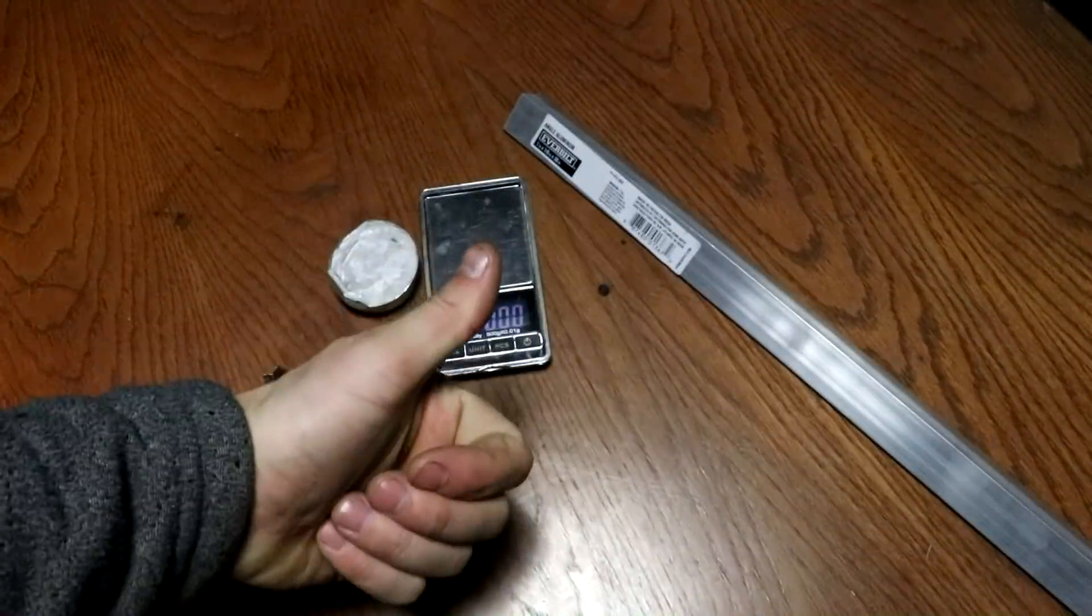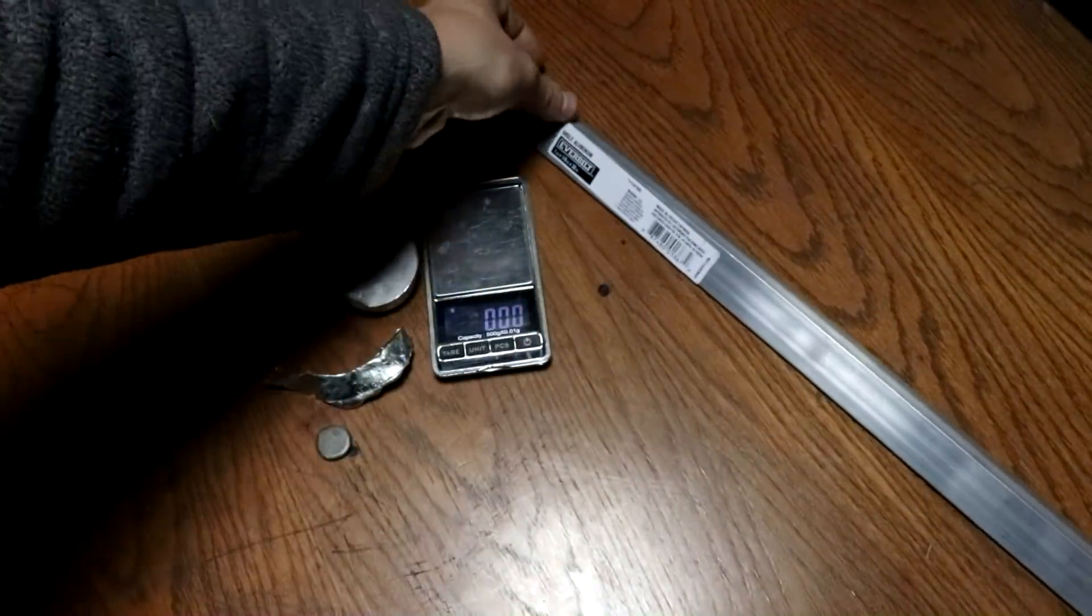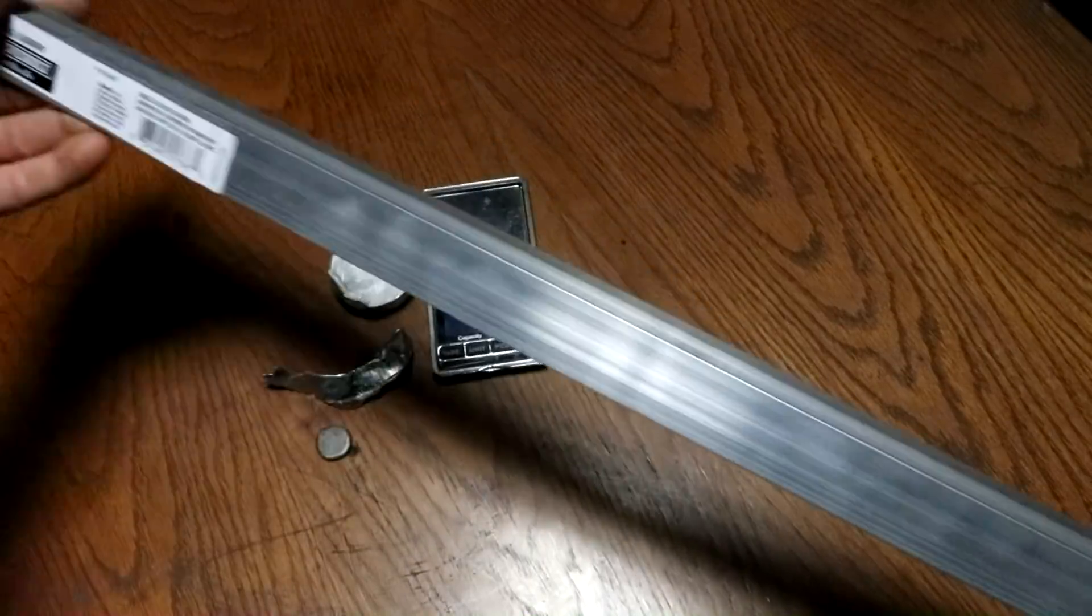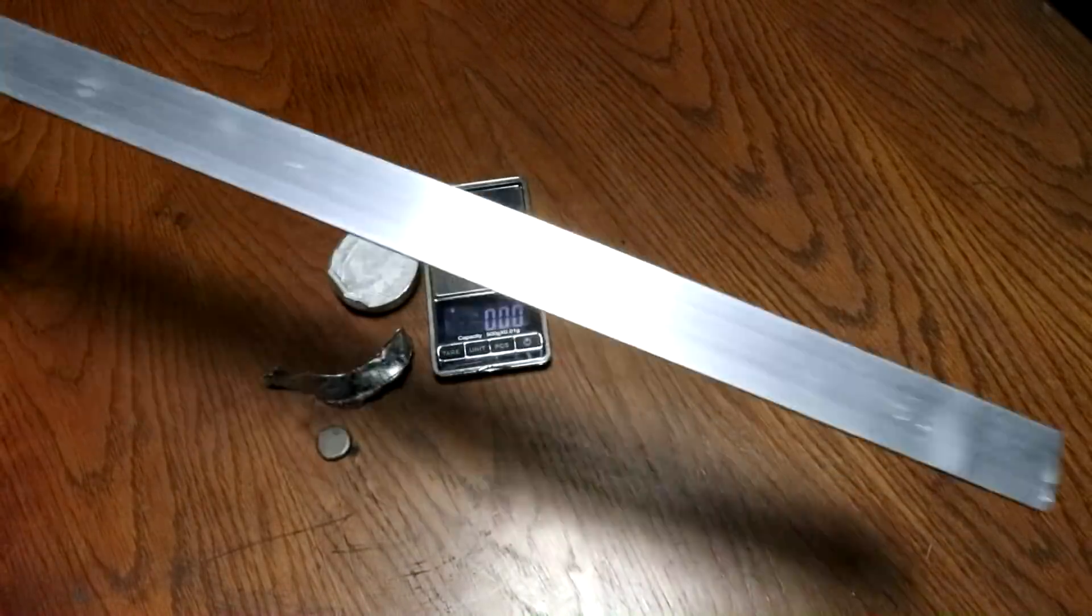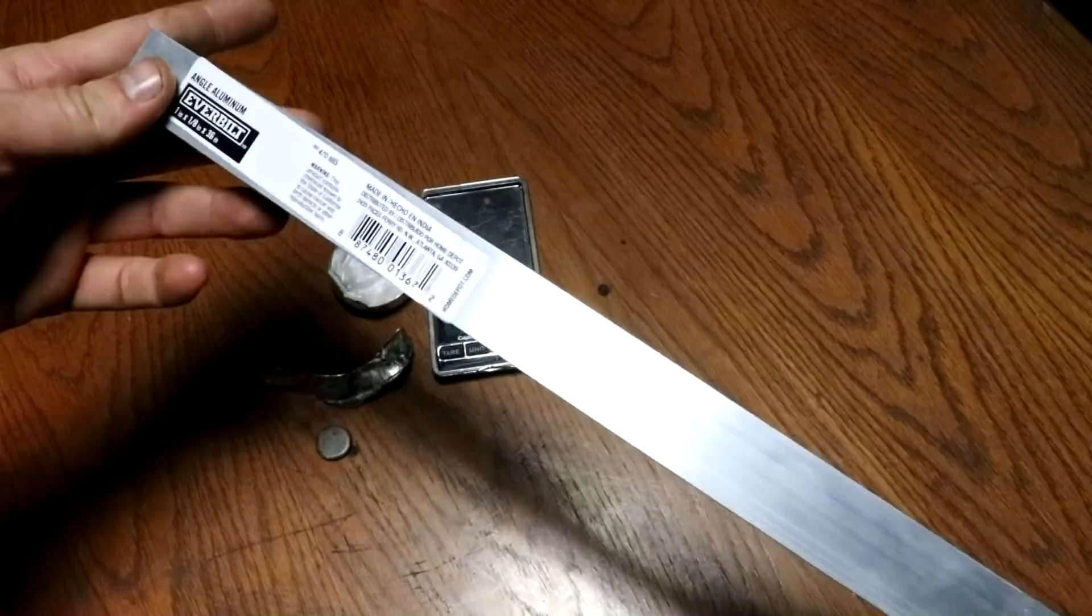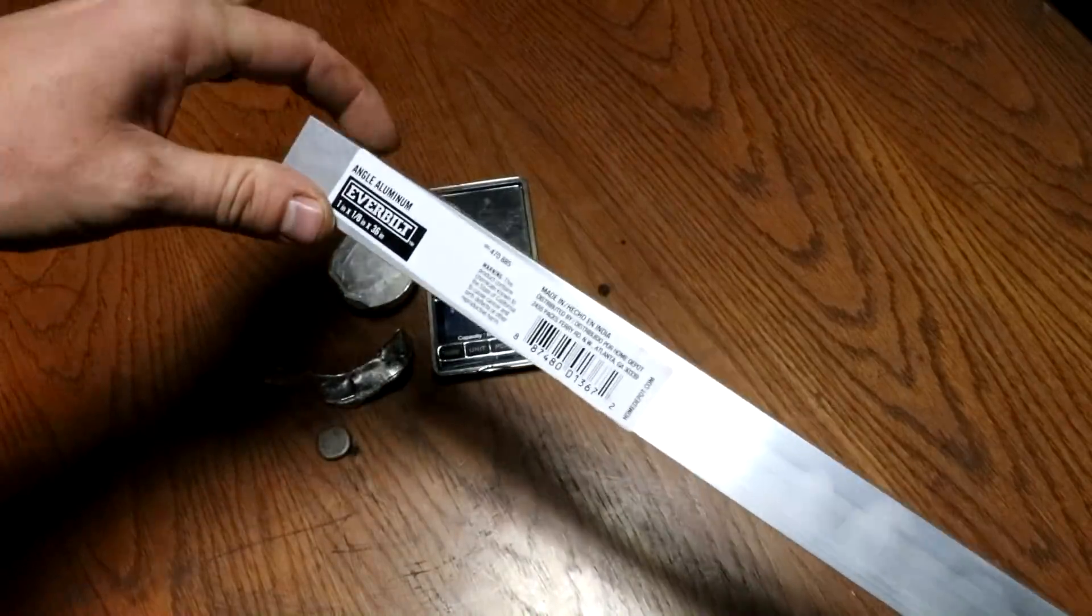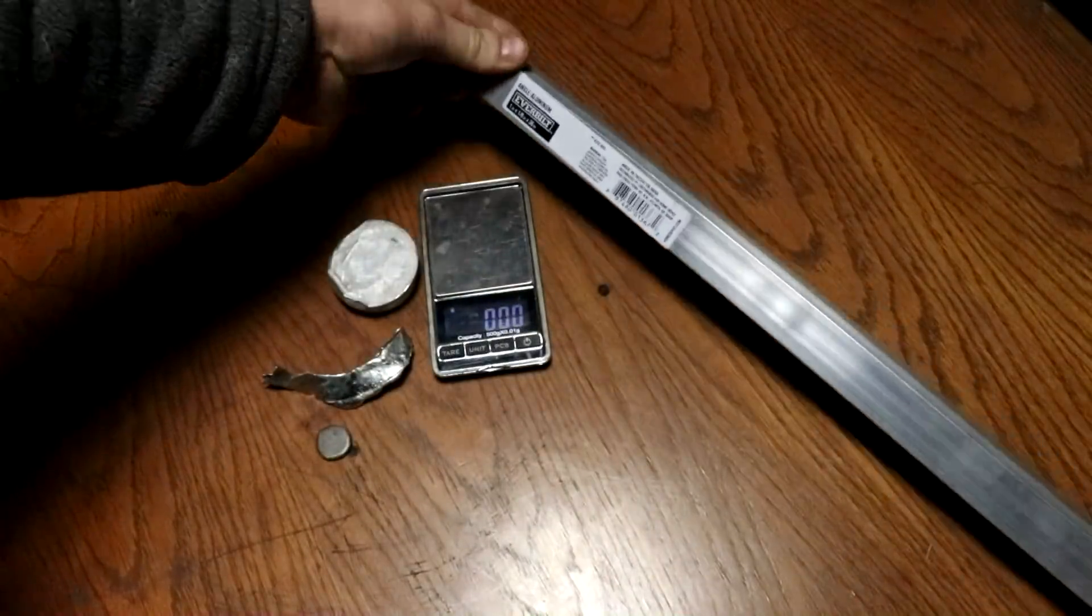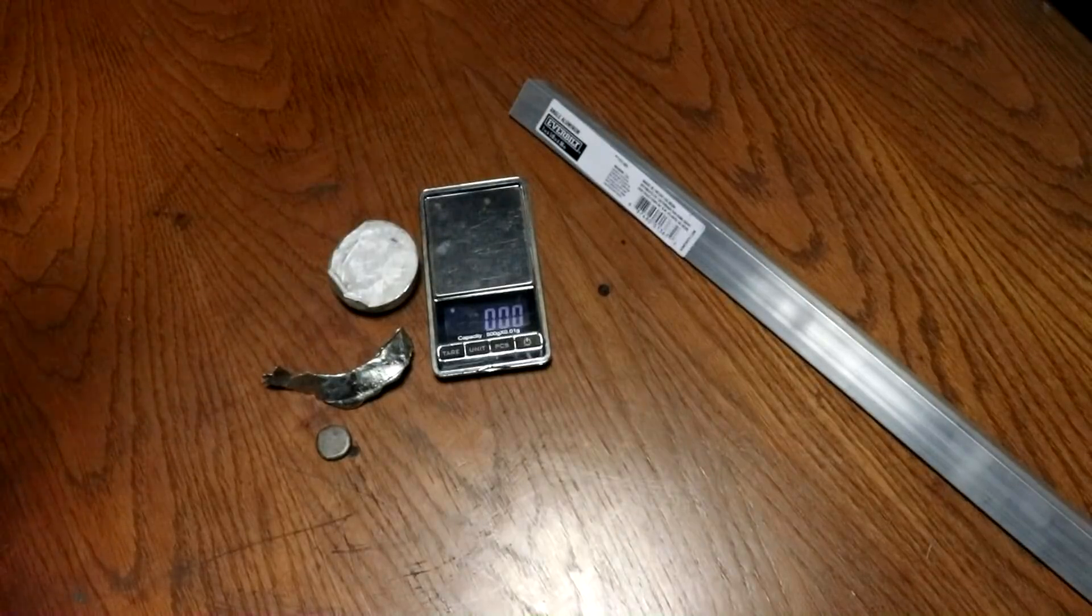Alright everyone, welcome back to Cody's Lab. So I have here a chunk of aluminum, angle aluminum. It's about 3 nanolight seconds long, but of course I'm only going to be using a small piece of it. Because today I want to actually destroy it using a liquid metal.